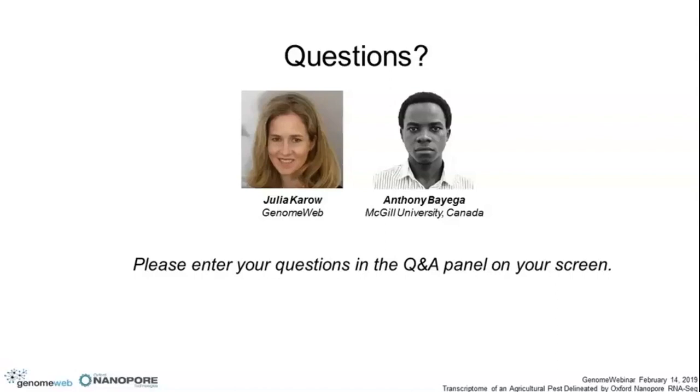A number of pretty technical questions. One refers to something early in your talk, and that is, how did you calculate the error rate in your comparison between raw read, Canu, and Canu plus Lordec? And also, did you check for any possible artifact chimeras when running Canu?